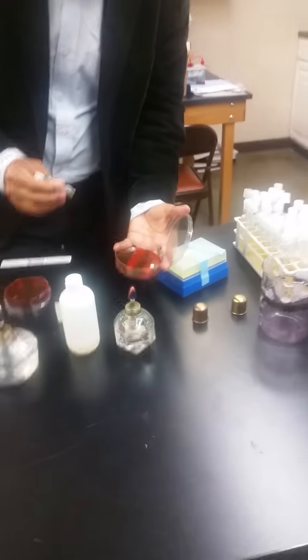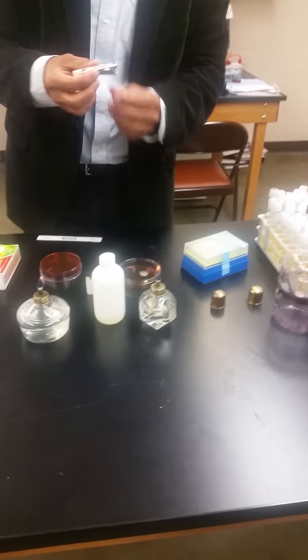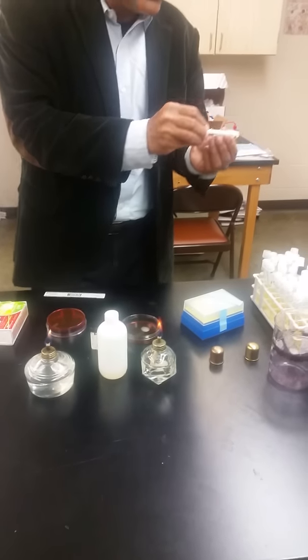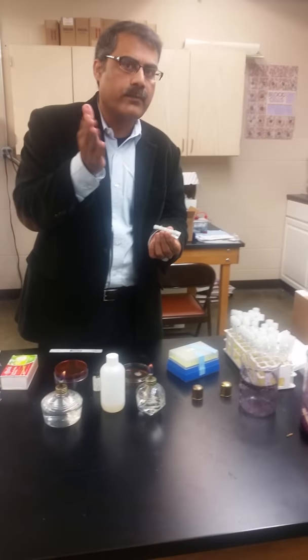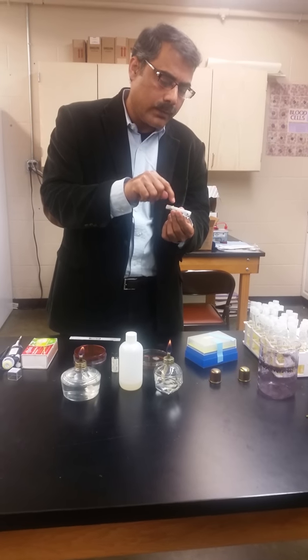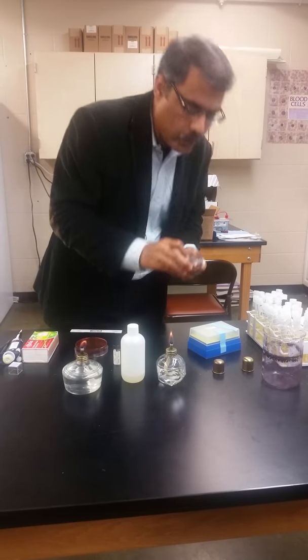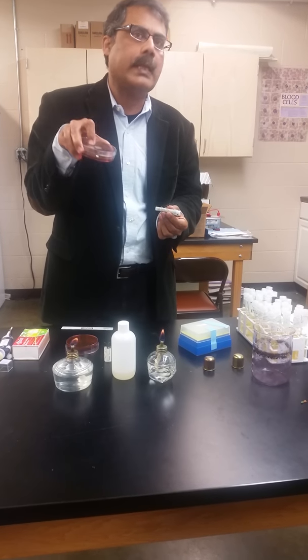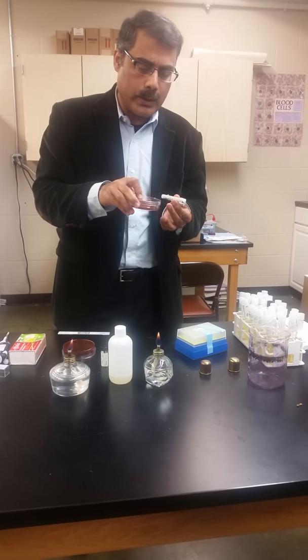Like this. Is one that I need, and when you observe these, you will find that it says on it what antibiotic it is, and in the front it says the number. So the name of this antibiotic is streptomycin, and the number is also shown on this little disc. It says 10, which means 10 micrograms per ml. Okay? That's what the concentration is.